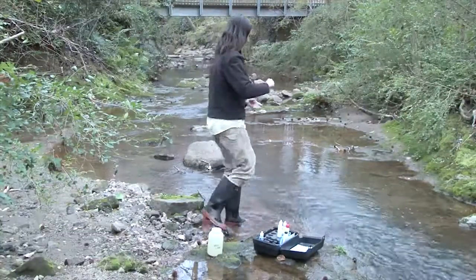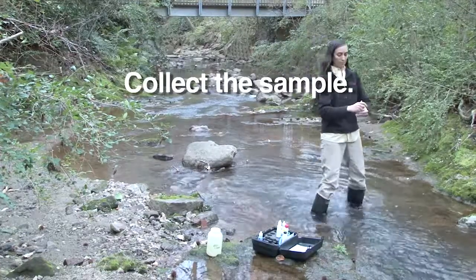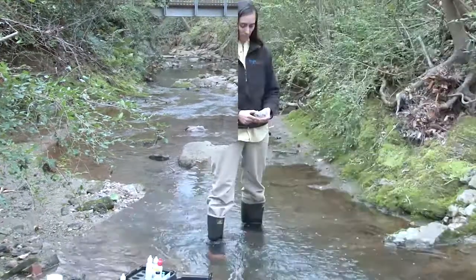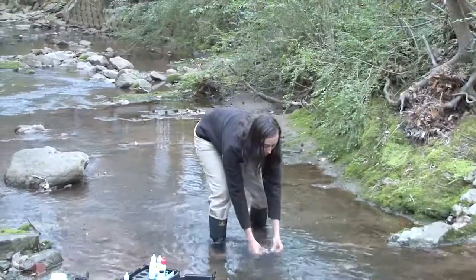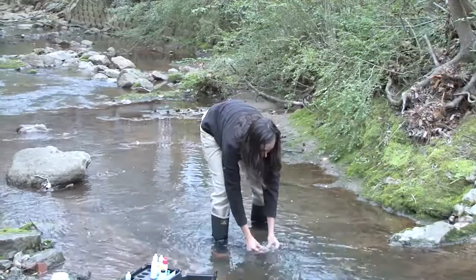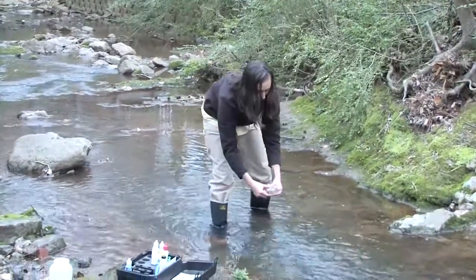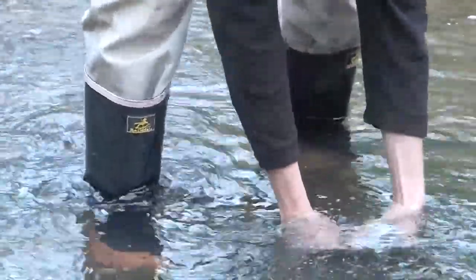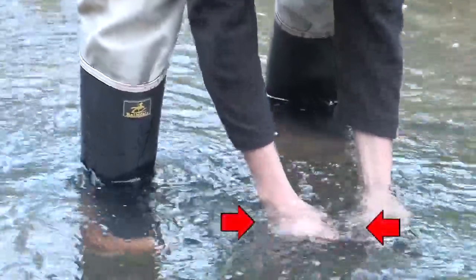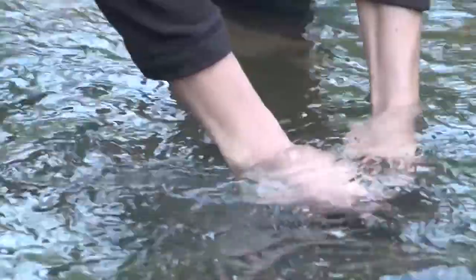She goes to the center of the stream where it's deep enough to get her sample. She faces upstream. First, she rinses the sample bottles with stream water, twice. Then she collects the samples. Watch how she submerges the bottles. When both bottles fill completely, she caps them under water. This step is important to ensure there are no air bubbles in the sample that will alter the reading.